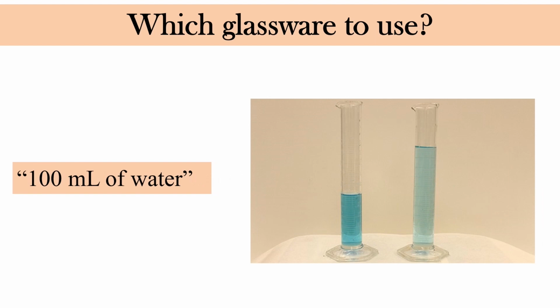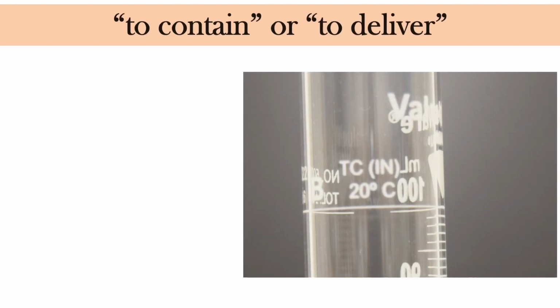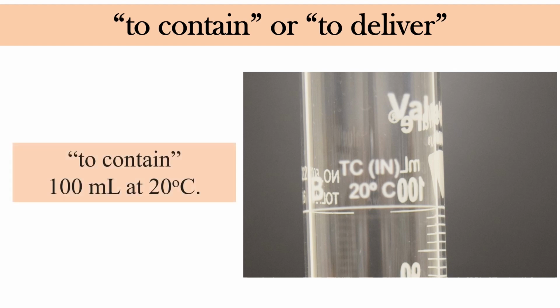On the other hand, if a procedure asks you to dissolve something in 100 milliliters of water, a 100 milliliter cylinder would work best. Glassware is also labeled with what it is intended to contain, TC, or deliver, TD. Here, this graduated cylinder is intended to contain 100 milliliters at 20 degrees Celsius.